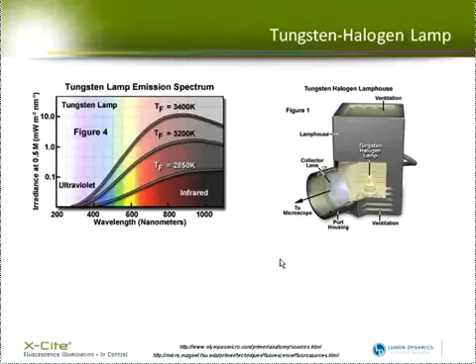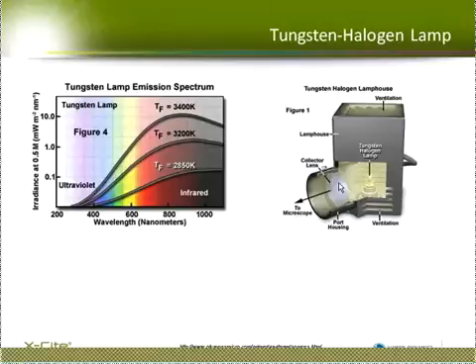So I'll move now into the, this shows the spectra of the lamp. This is the intensity on the Y scale here and the wavelength on the X scale. And you can see the color coding here going from violet to blue to red. And you'll see that the lamp has a very high component in the infrared, a lot of light out in the infrared, and then a fair bit of light in the visible.